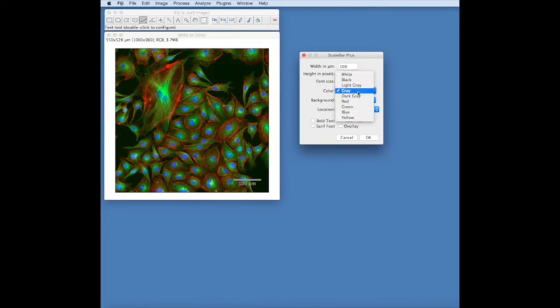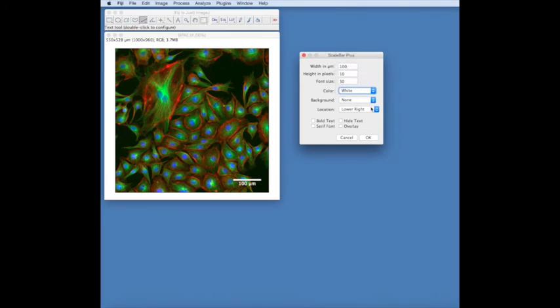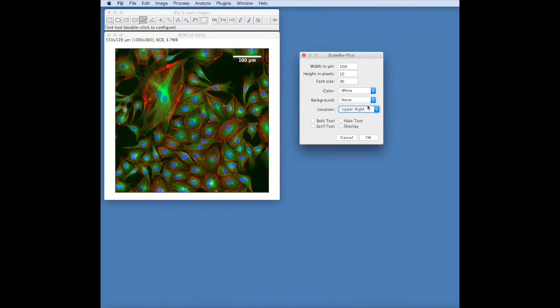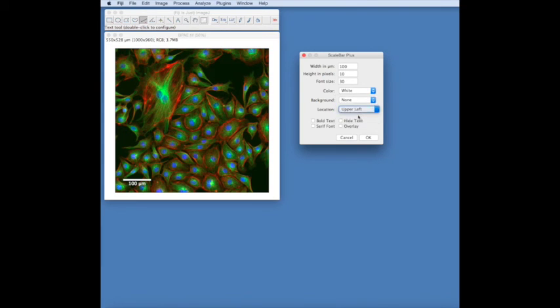And the position in the four corners of the image, or at selection.